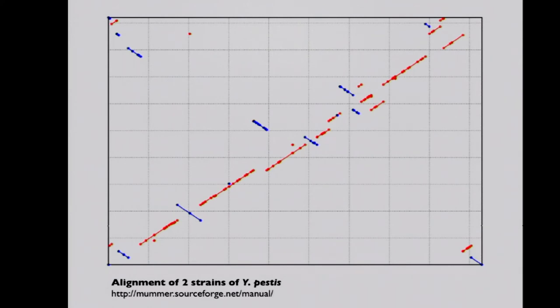That would be a good thought. So it jumps to the right. So that would suggest that this sequence is unique to this genome. But if you notice, it's exactly in line with this sequence over here. So what happened is the piece that lived over here, it's anti-diagonal, so it was inverted and it moved into a different position. So it was an inverted translocation.